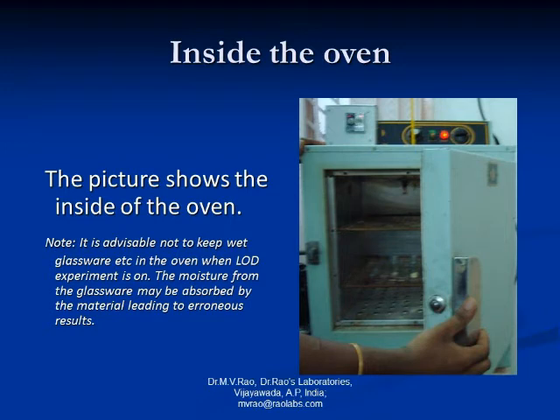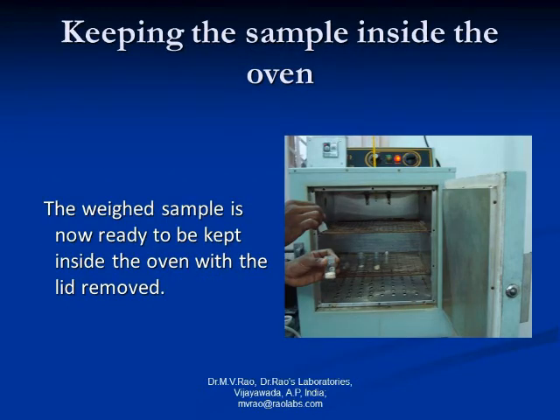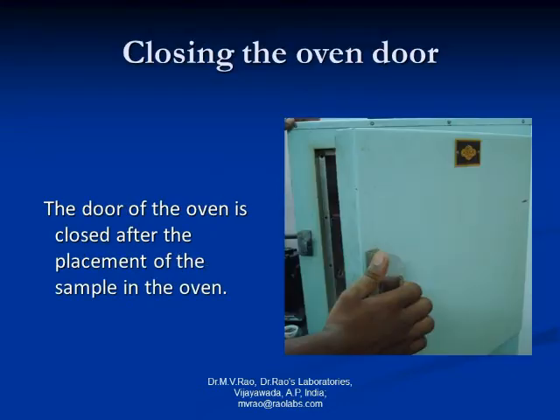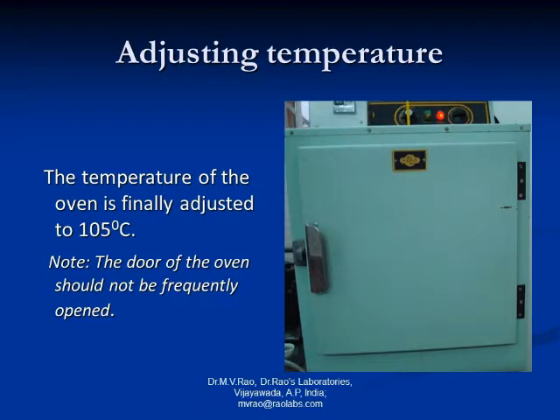This is the inside of the oven. It is advisable not to keep wet glassware in the oven when the loss on drying experiment is on, as moisture from the glassware may be absorbed by the material leading to erroneous results. The weighed sample is now ready to be kept inside the oven with the lid removed. The lid must be kept separately in the oven. The sample is placed inside the oven as shown, and the door is closed. The temperature of the oven should be finally 105 degrees centigrade, and the door should not be frequently opened.